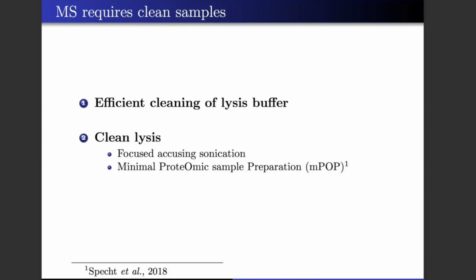We mostly means Harrison Specht, a graduate student in my lab, that again lyses cells in pure water and can do this in parallel for hundreds of cells very, very quickly, much more reproducibly, in much, much smaller volume than what was previously possible with Covaris. And this is something that I have reserved the privilege and honor for Harrison to tell you himself tomorrow. And I'll tell you a little bit about results using this method, but he will present the full development. And very soon, maybe next week or so, you'll be able to delve into all the details in a forthcoming preprint on the method.